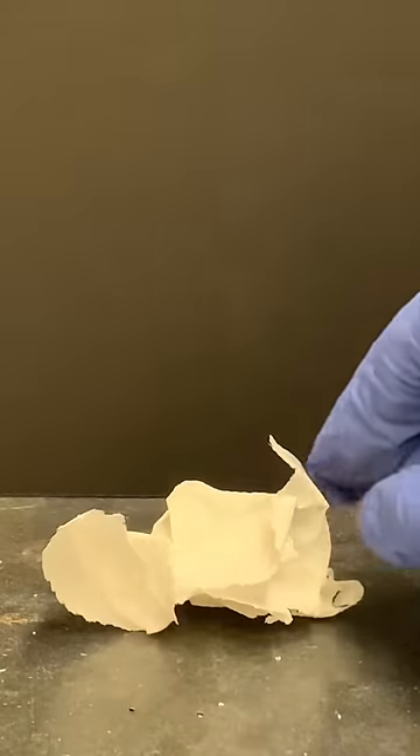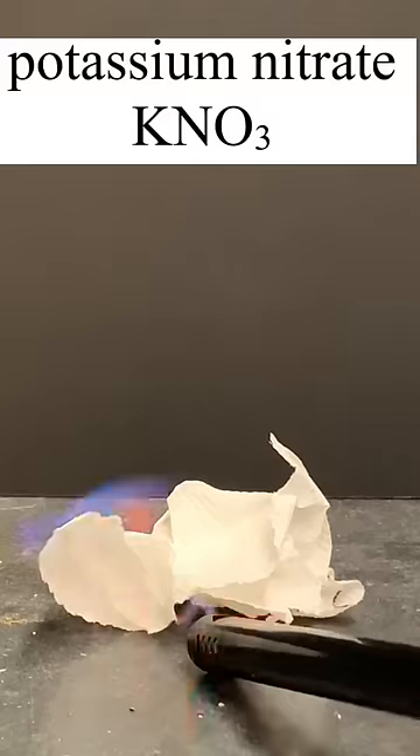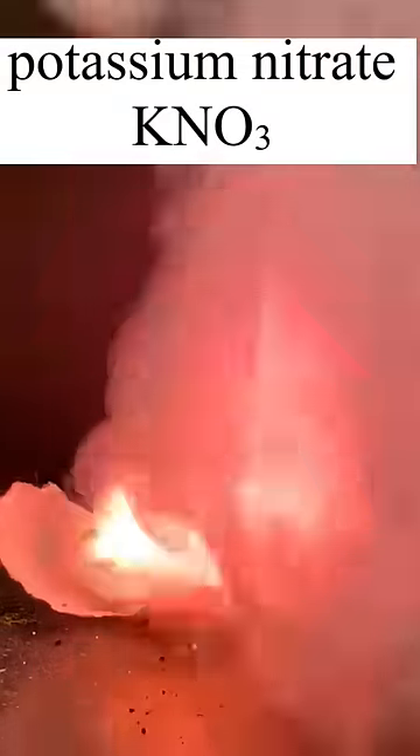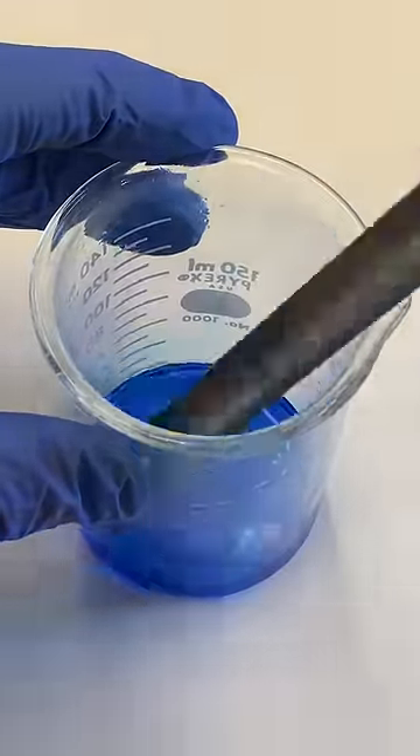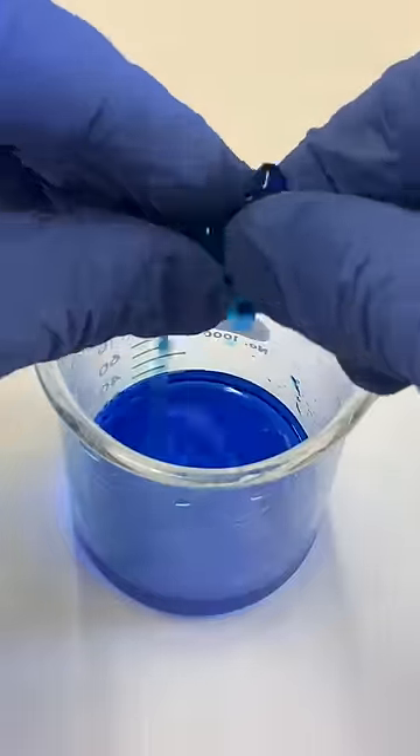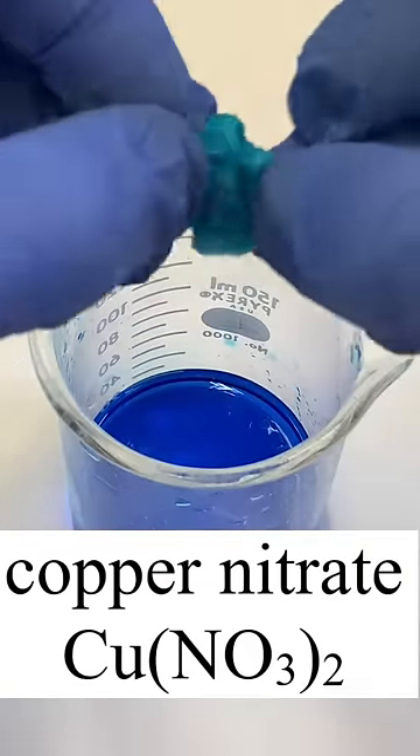In a previous video, I demonstrated how soaking paper towels in potassium nitrate causes the paper towels to burn a lot better when ignited. These experiments were really interesting to me and they made me wonder what would happen if I soaked paper towels in solutions of copper nitrate instead of potassium nitrate.